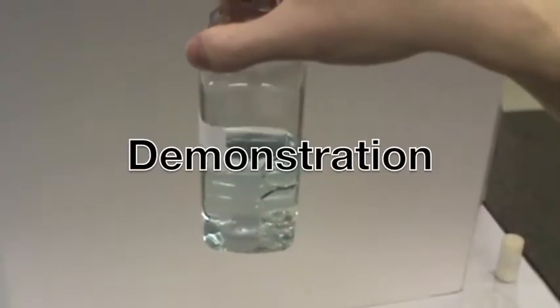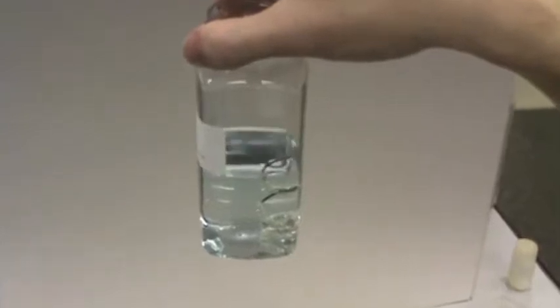Show students the jar of silver nitrate from the beginning of the experiment.